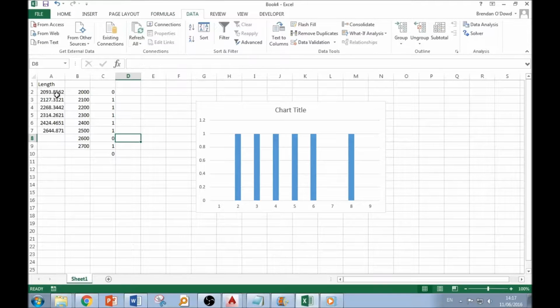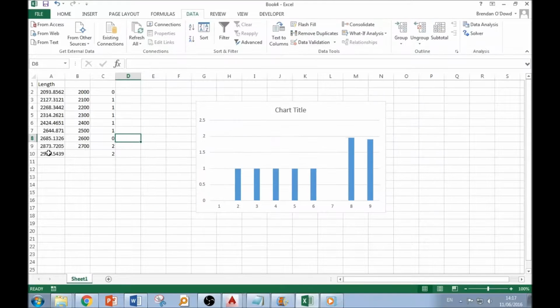and this will refresh the text file that was used to make this column of data. So I click that and hit import, and you notice that 3 extra data points are added, and my histogram has changed now. These data points have been added there as well.